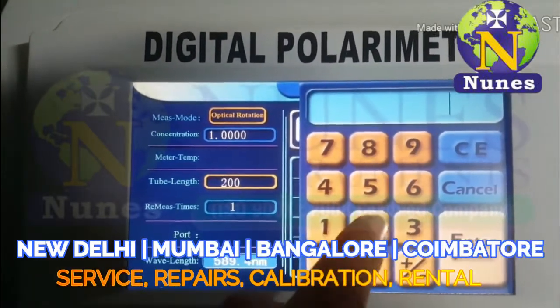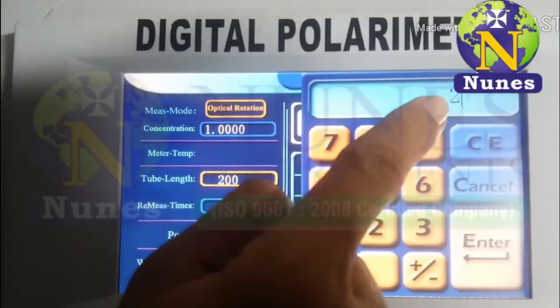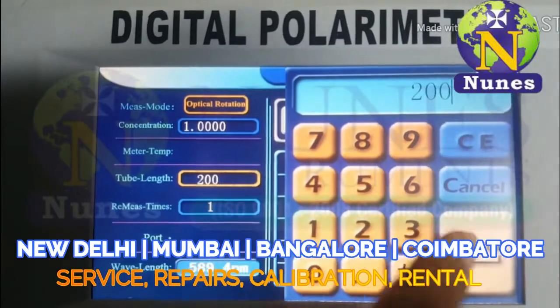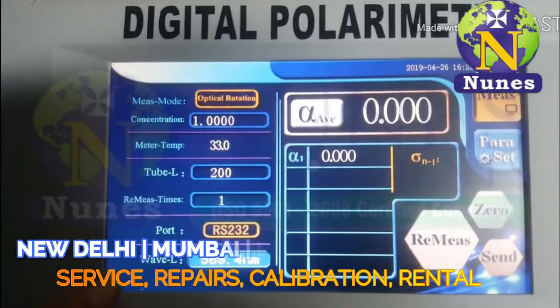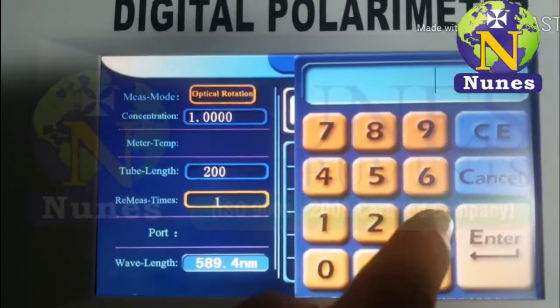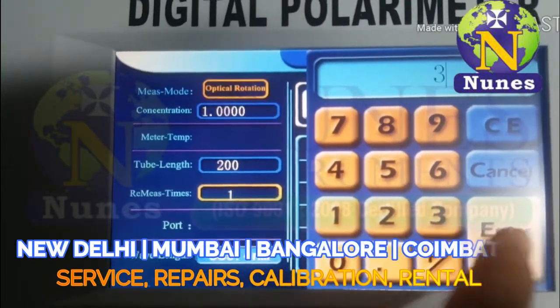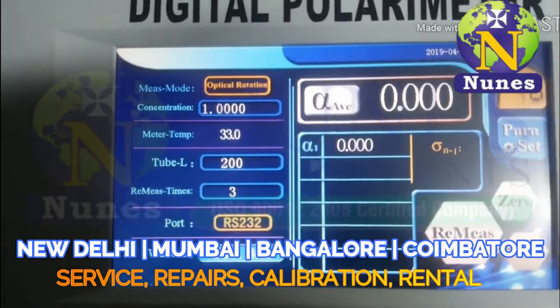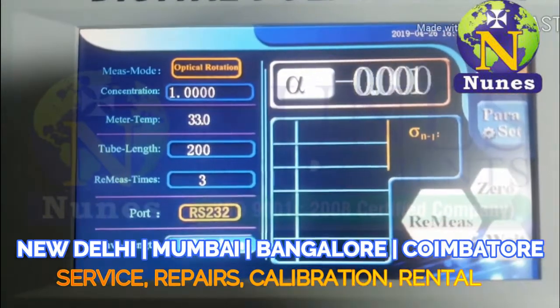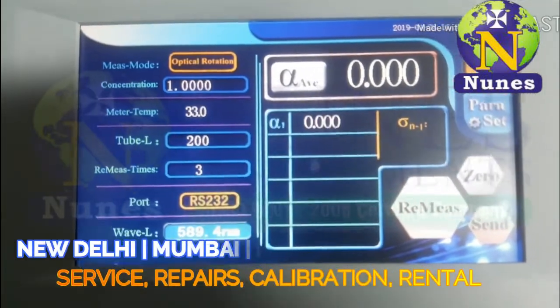Now select the tube length. We select 200 mm, press enter. Now we select measure time — select three, possible up to six. Confirm limit. Zero zero zero is stable.